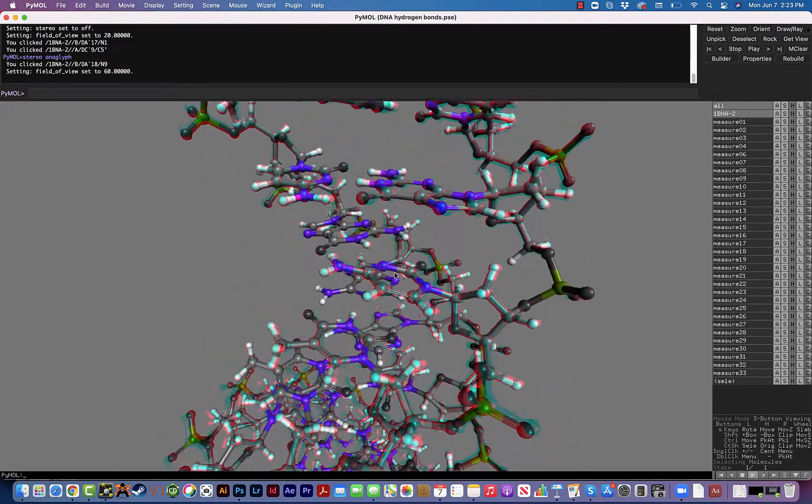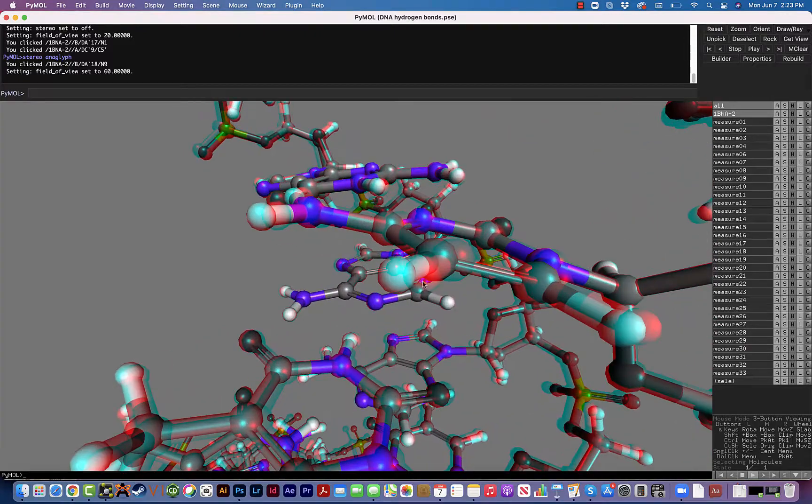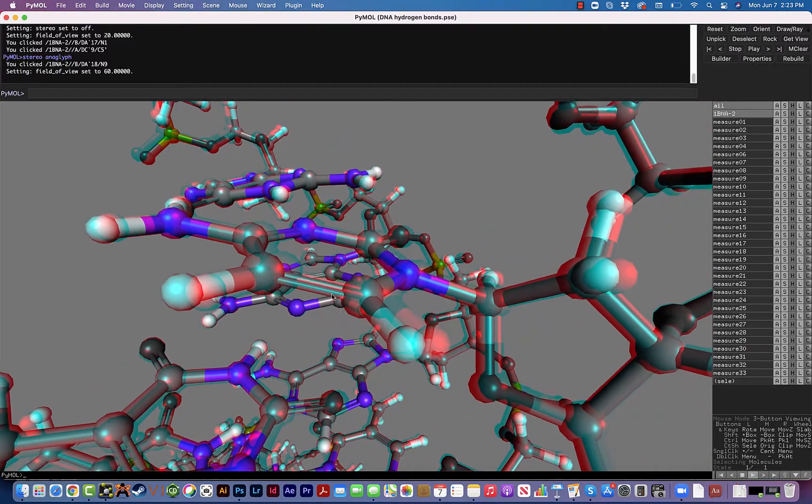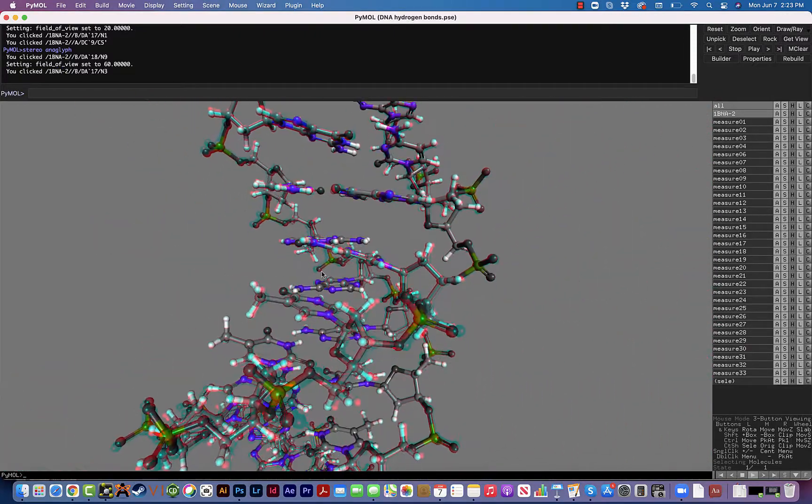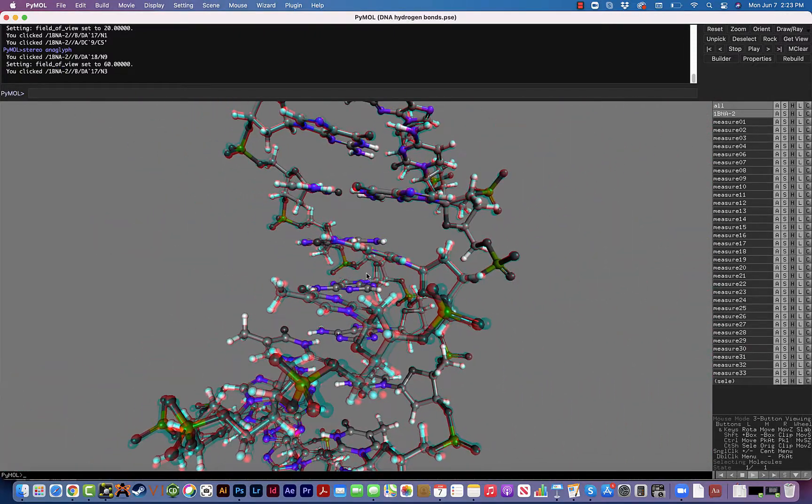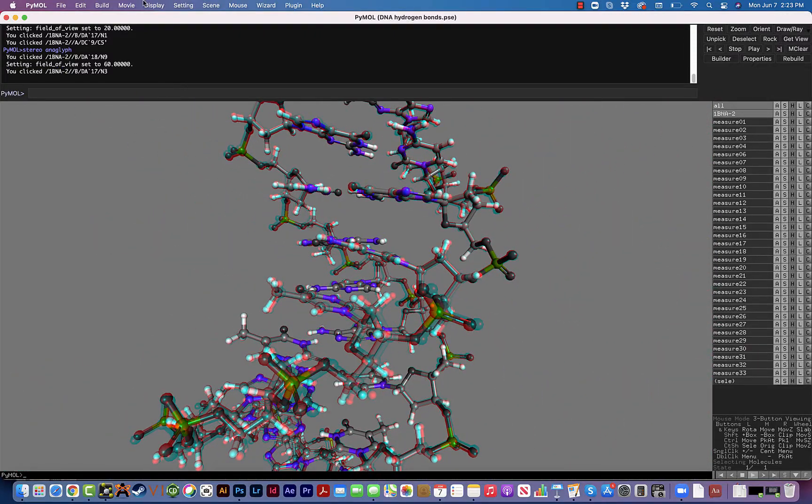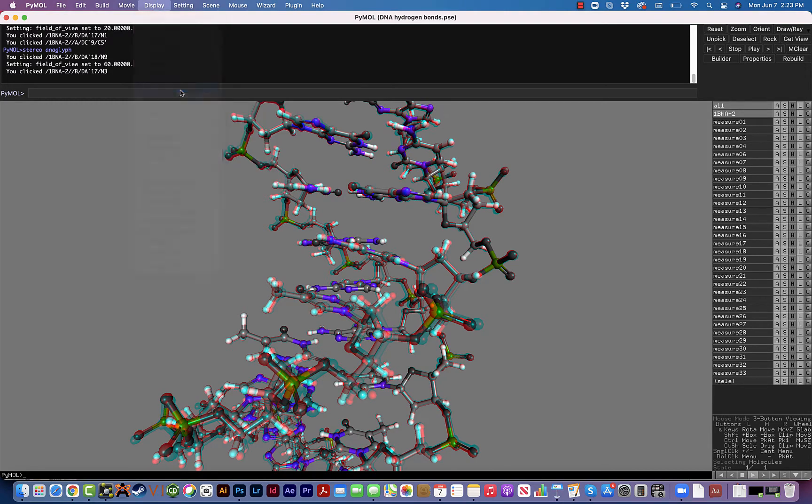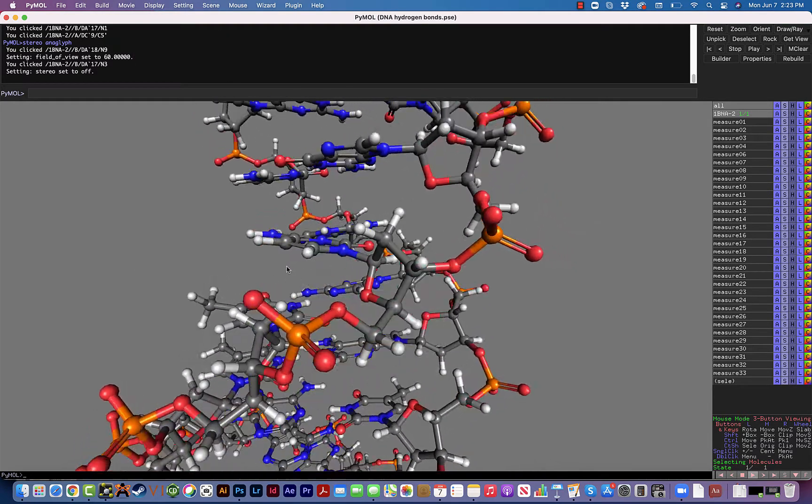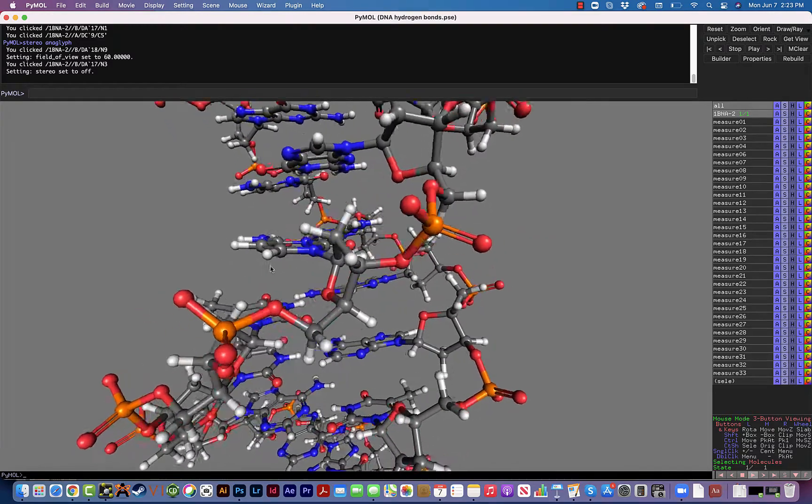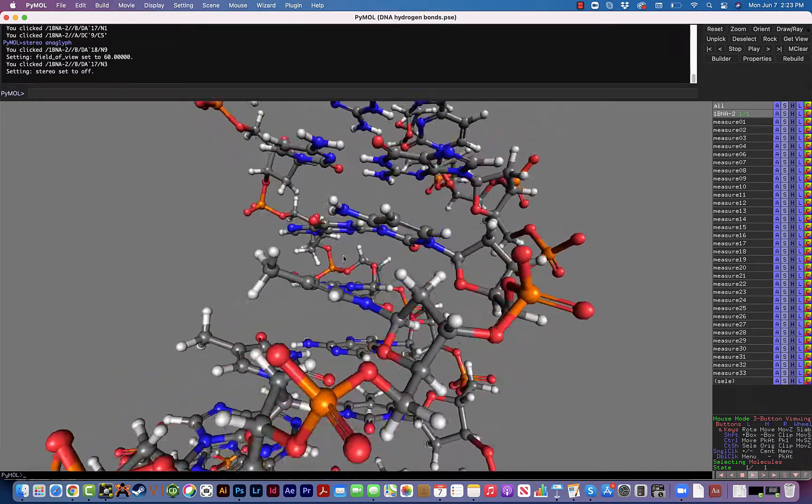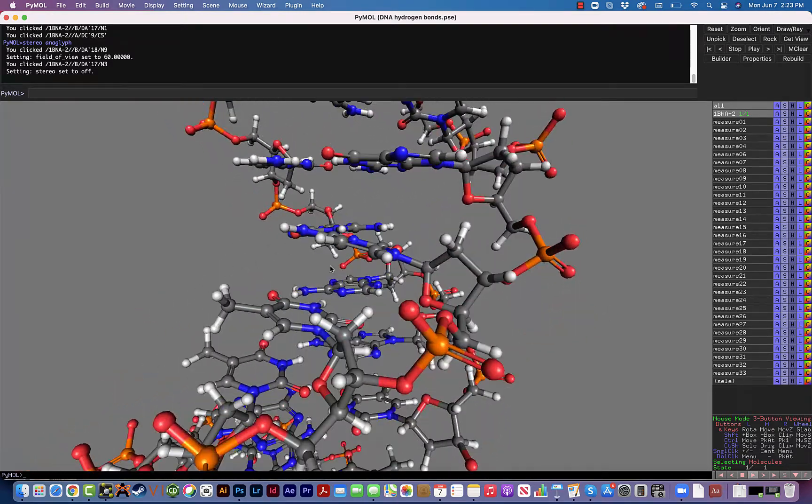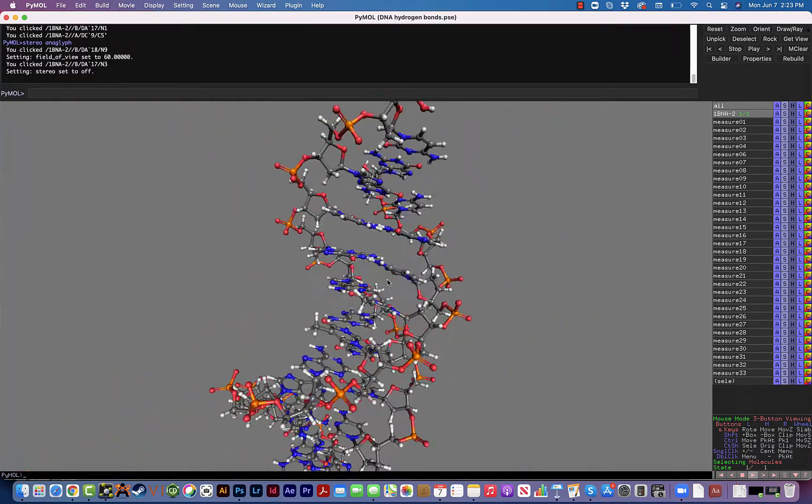The one problem is that you do lose some of the colors because of the way the anaglyph stereo works. When you're ready to turn it off, you can go to Display and then unclick the stereo and we're kind of all back to normal. That fisheye effect is still there, which is kind of cool to see.